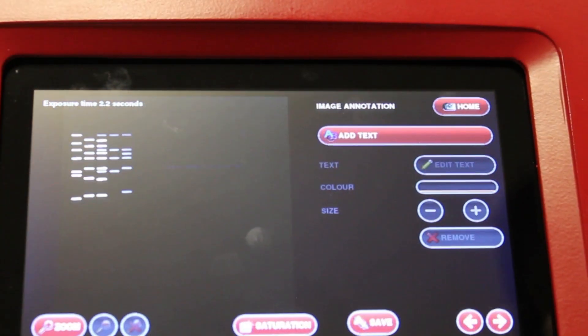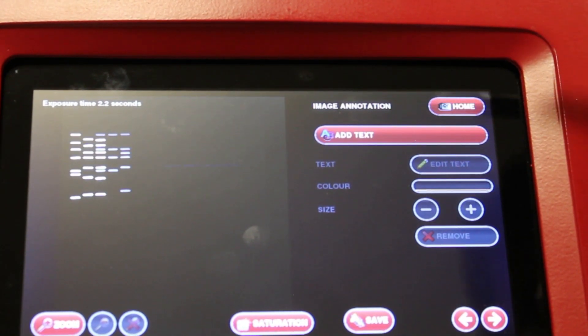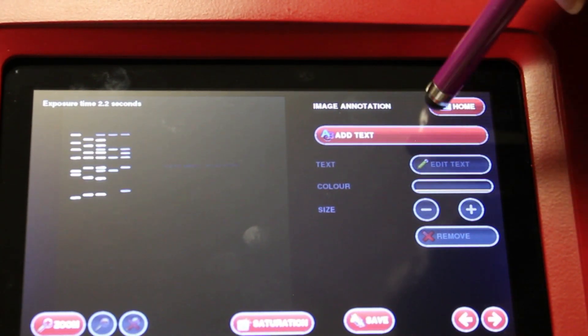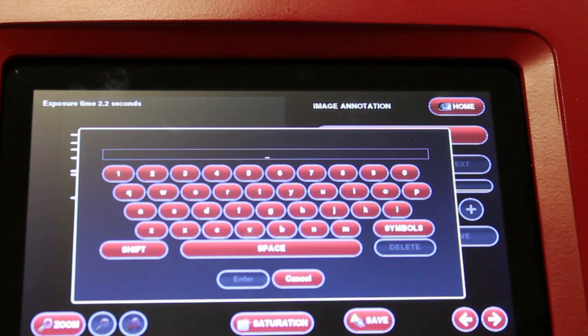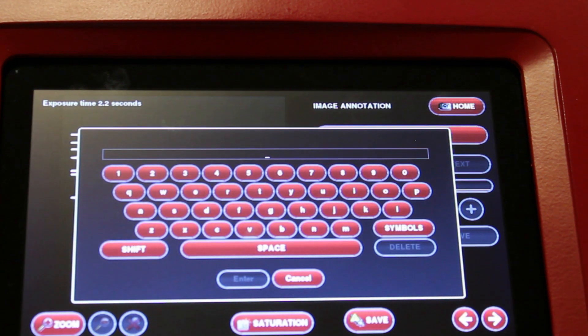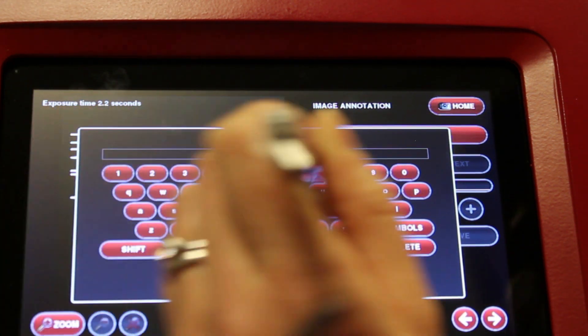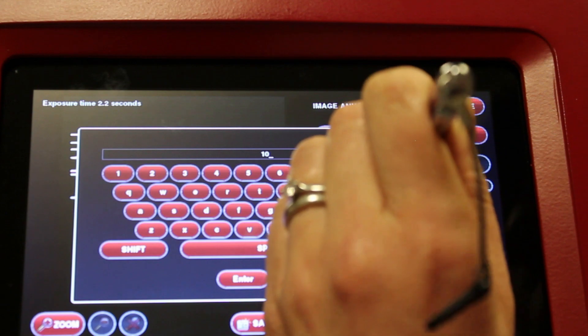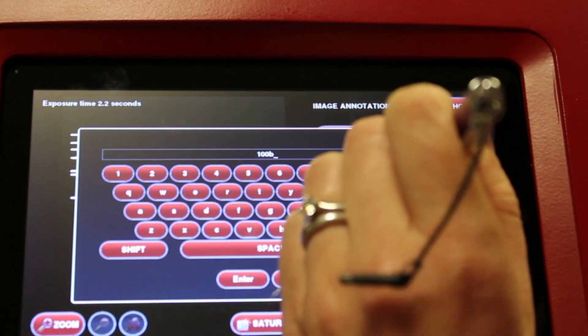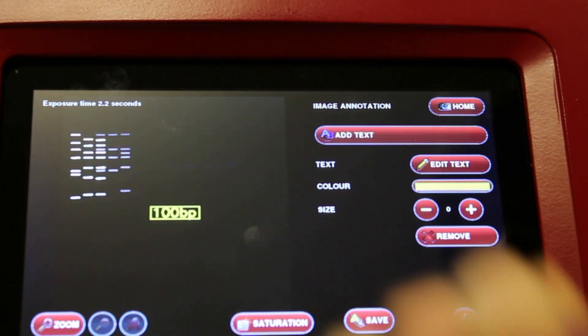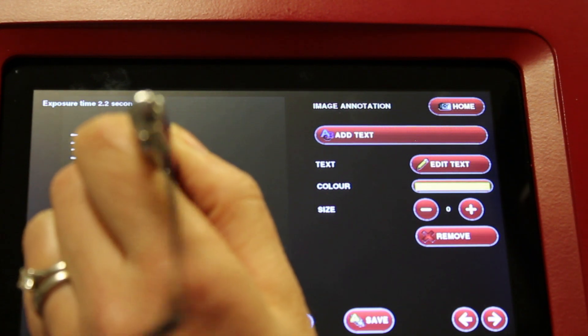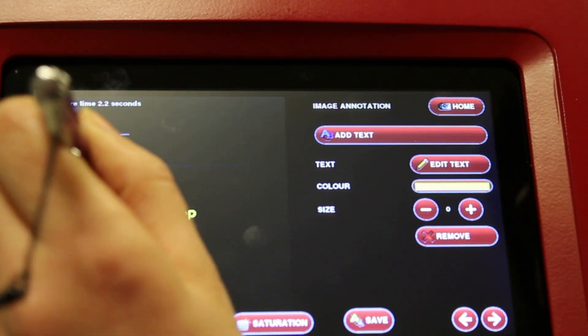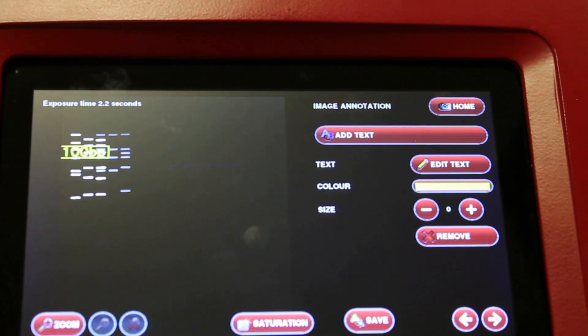You can also add text to your image. Pressing the add text button should bring up an on-screen keyboard. You can type in, for example, if you had a hundred base pairs, and press enter. Then you can move that text anywhere you want on your image.